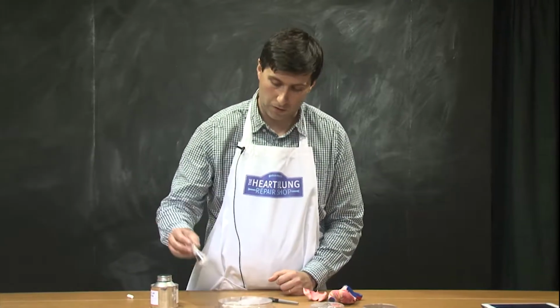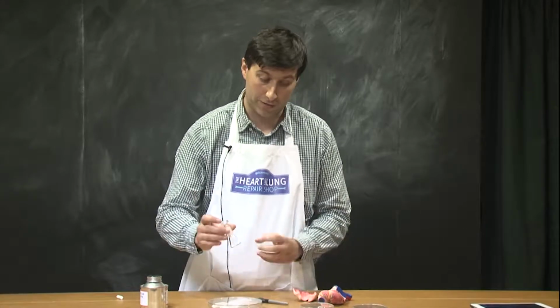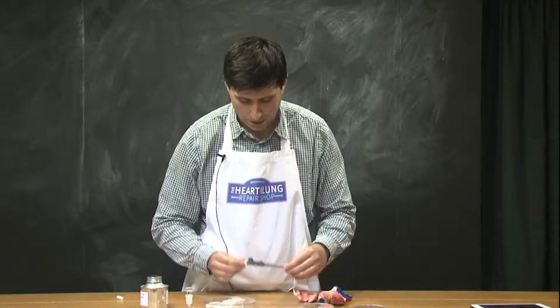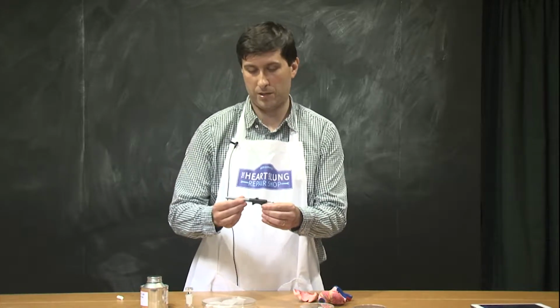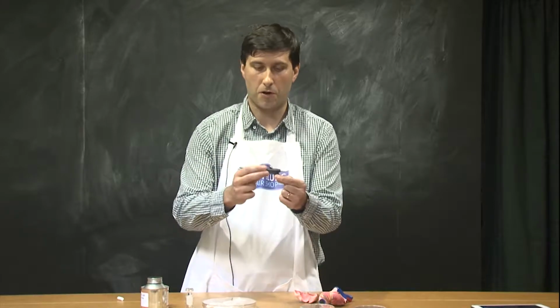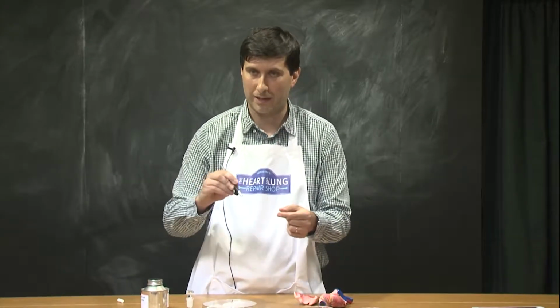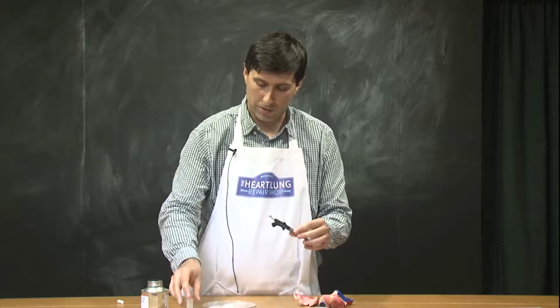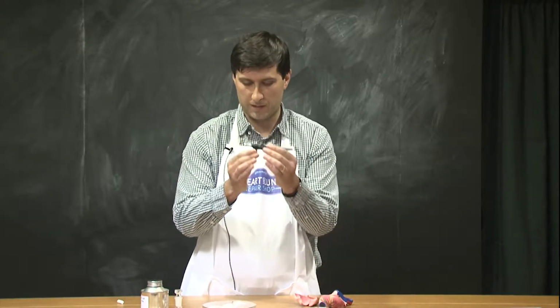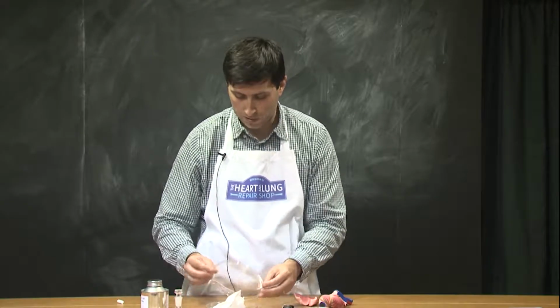So how do we go from this kind of material to a structure that more resembles a tissue? We're using an object which might be an everyday object. This is an airbrush that hobbyists might use to paint little metal cars, things like that. We make a solution of the material and spray it onto a specially designed device to create what is called the fiber.